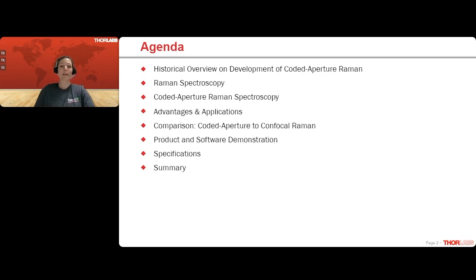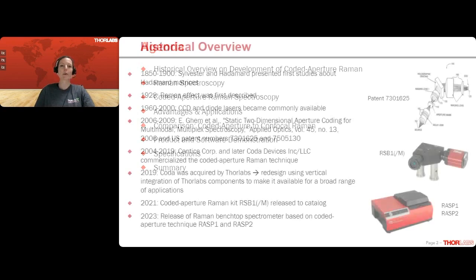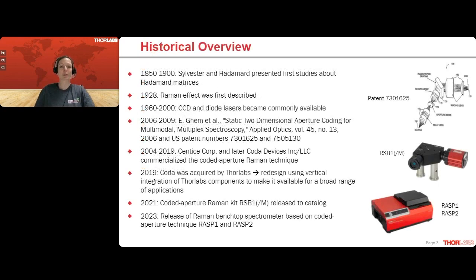Afterwards, we will have a look into a comparison of the Coded-Aperture approach to conventional confocal Raman systems that you might be familiar with. Afterwards, we will see a video in which I will show you how to use the device, how to position samples, how to perform measurements, calibrations, and how to use the database. Afterwards, we will review the specifications of the Raman device, and I will conclude with a short summary. So let's directly jump into the historical overview.